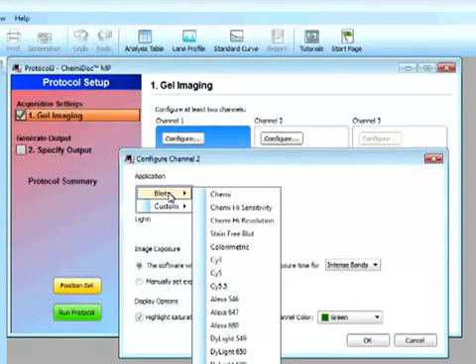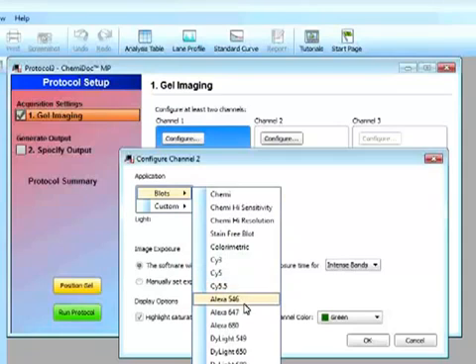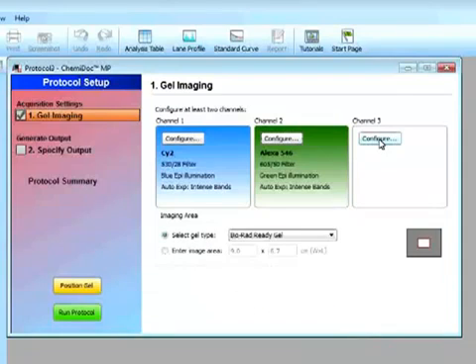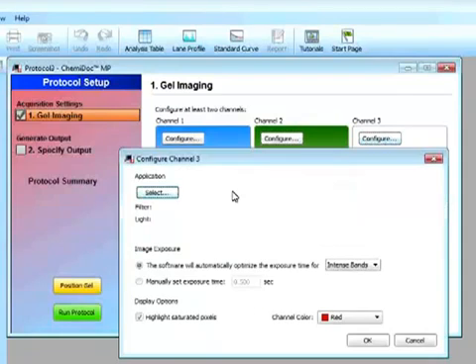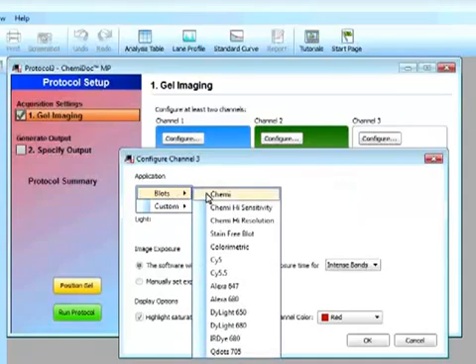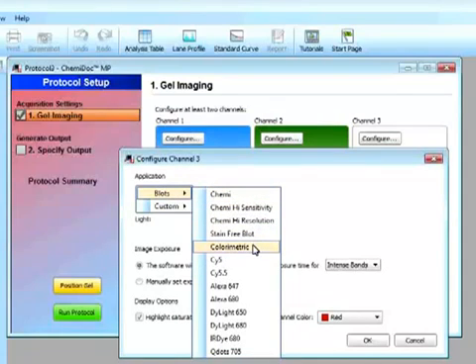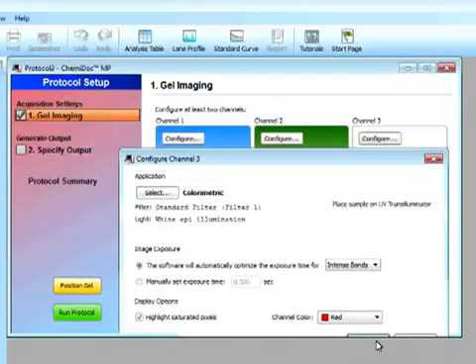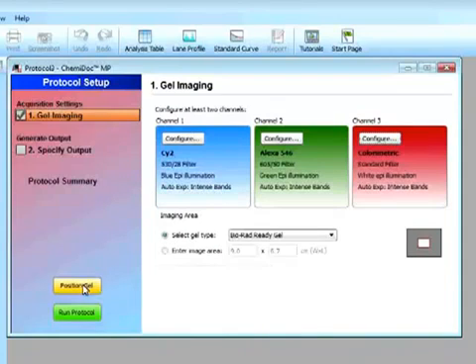And channel 2, say I want to look at Alexa 546. And I'll select it as green. And a nice feature is that I can also look at my colorimetric assay to look at my protein standard. So I can look at both my targets and my protein ladder in one blot. So I can compare, basically look at the molecular weight of my target protein. And then select a specific color. Click on OK.